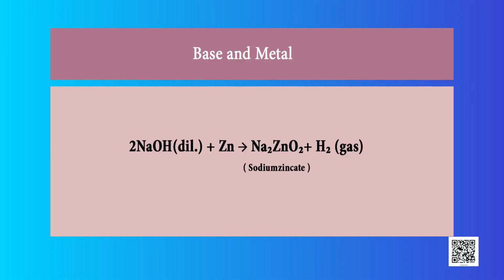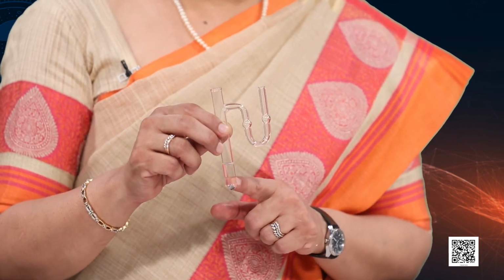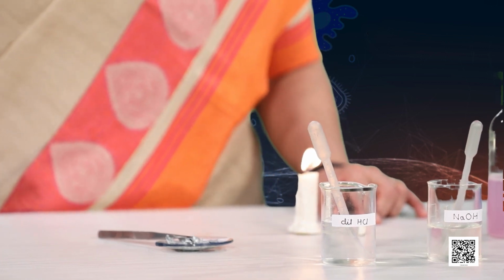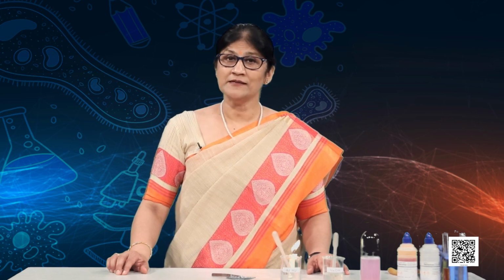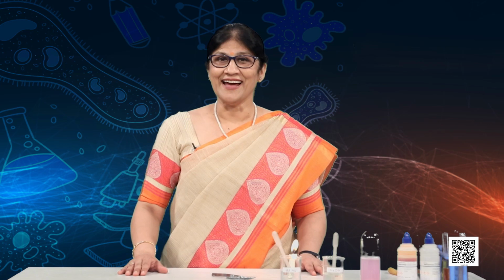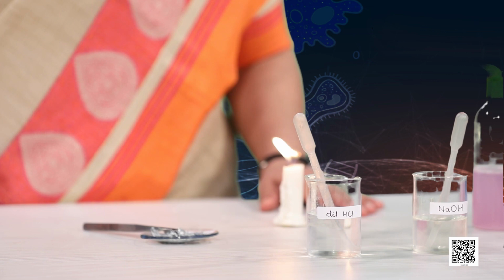So, let us see how a base reacts with metal. So, now we have added a metal piece, that is zinc, to the U-tube and some sodium hydroxide solution. In the U arm, we have added a soap solution. So, we have seen how zinc metal, which is a reactive metal, reacts with base sodium hydroxide and acid dilute HCl. You have to check with other metals too. Make a table and see whether all metals react in the same manner with acid and base. That is for you to check.